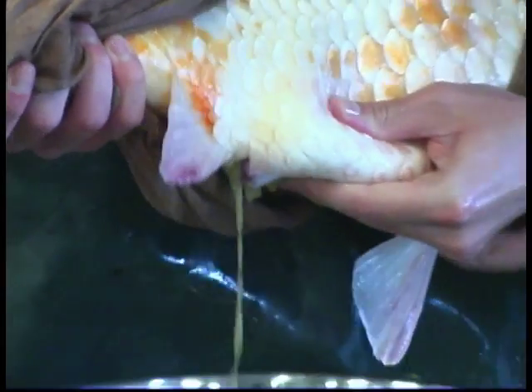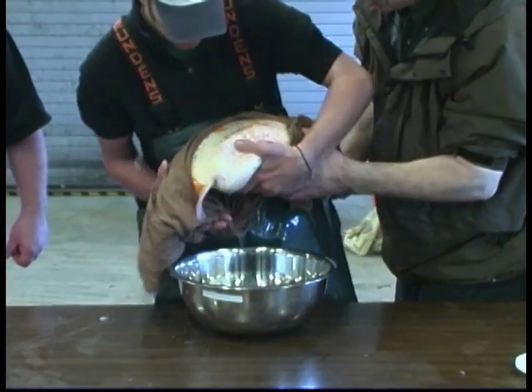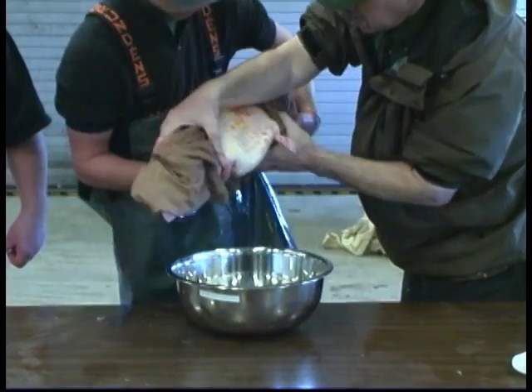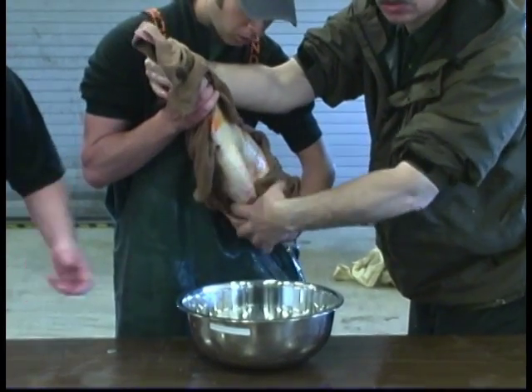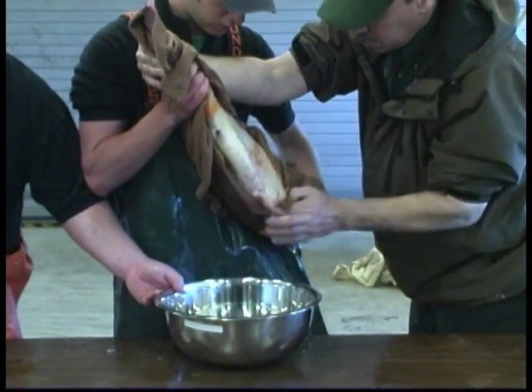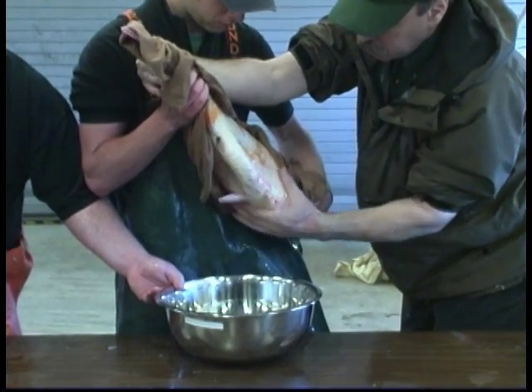You can put the fish a little vertical, and then massage this way. After that, try stripping from the front part as well.